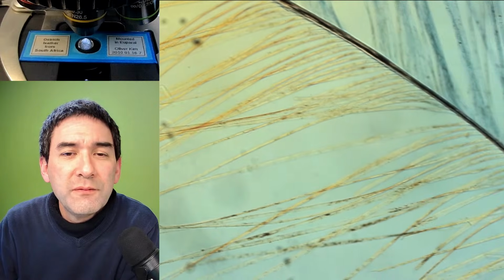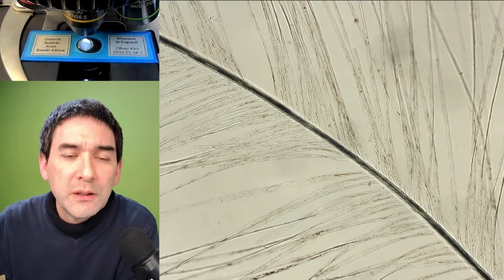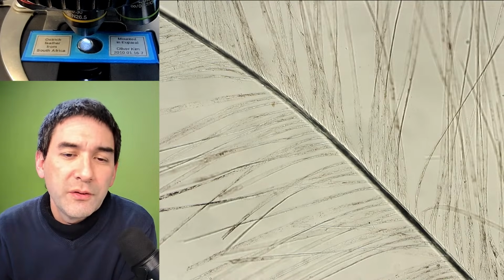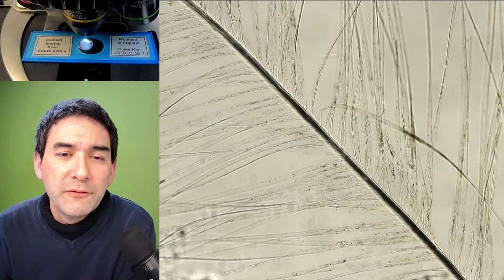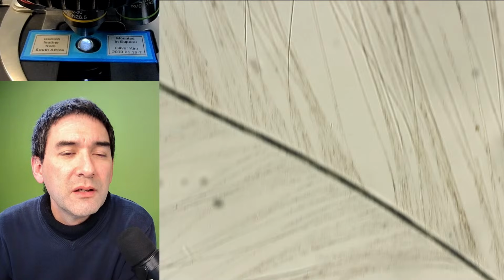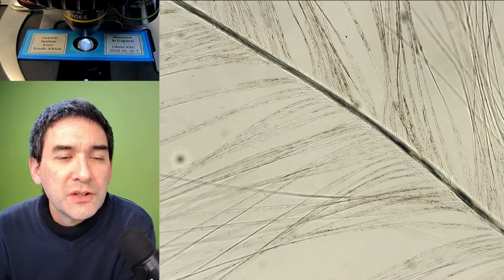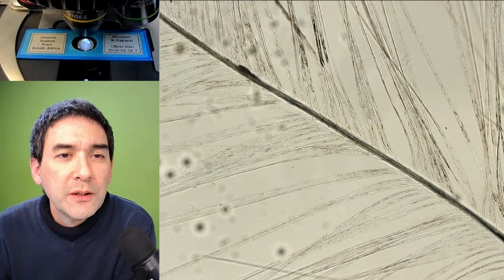This here is the feather of an ostrich, and because I've got DIC, I'm just going to look at it in bright field. But it looks a little bit like this feather has survived the past, well, in this case 16 years, because I made the slide a few years after I visited South Africa. So that is the feather of an ostrich.